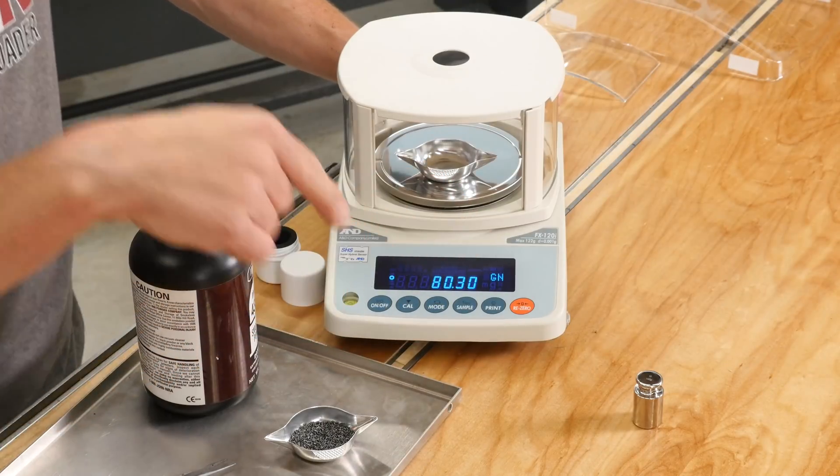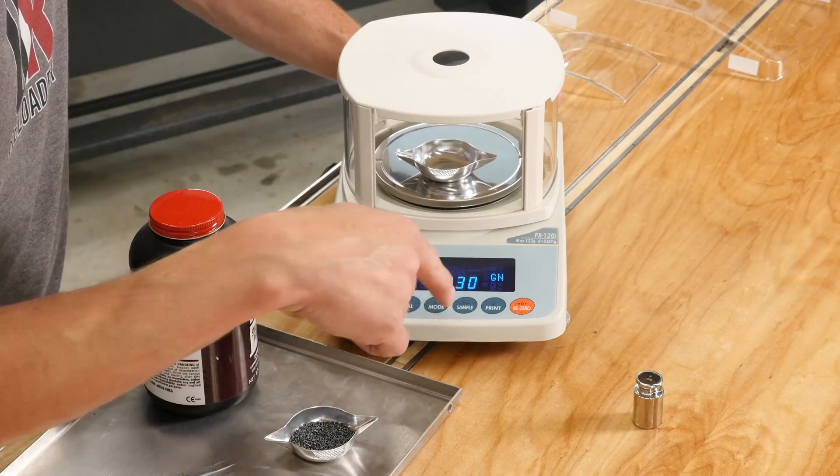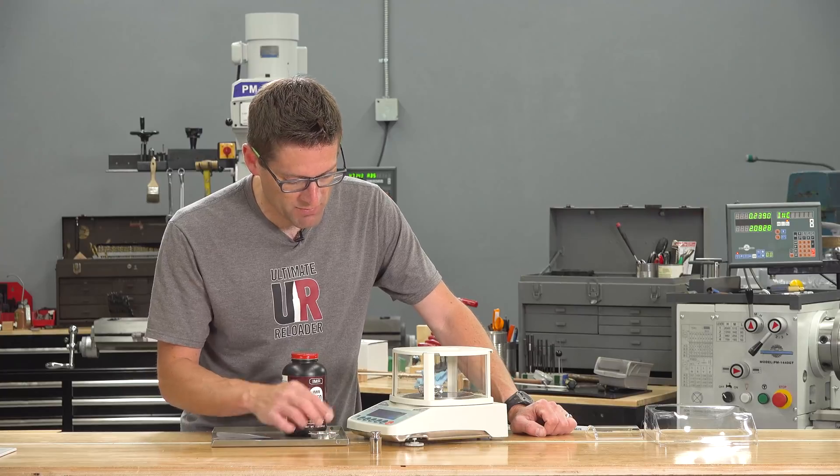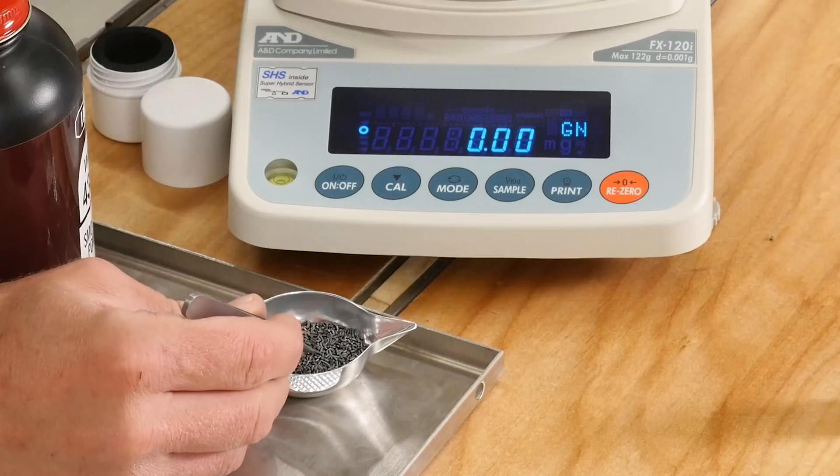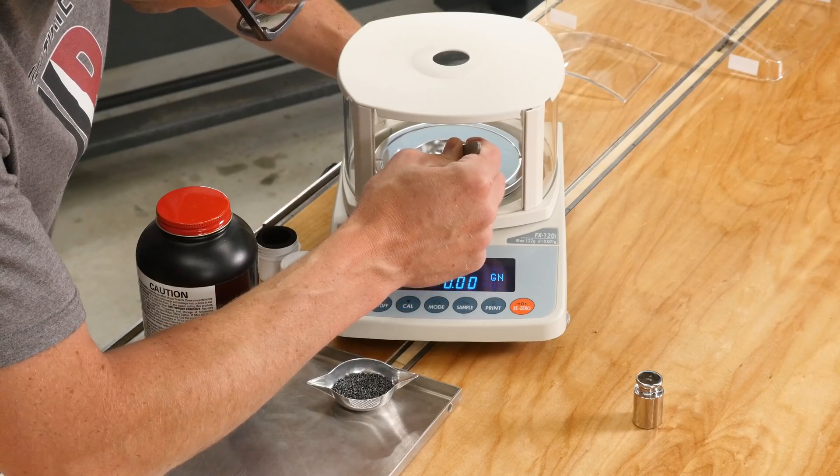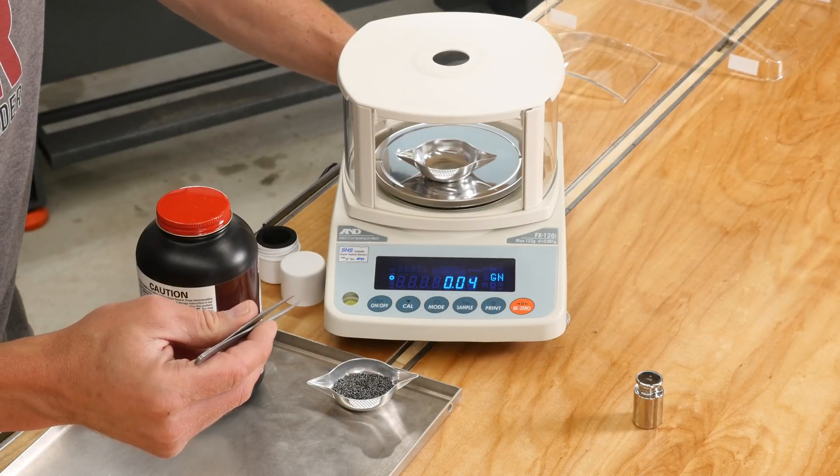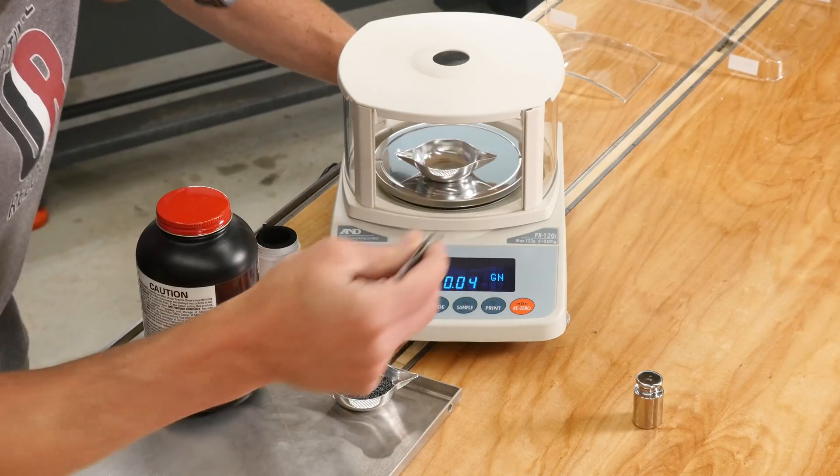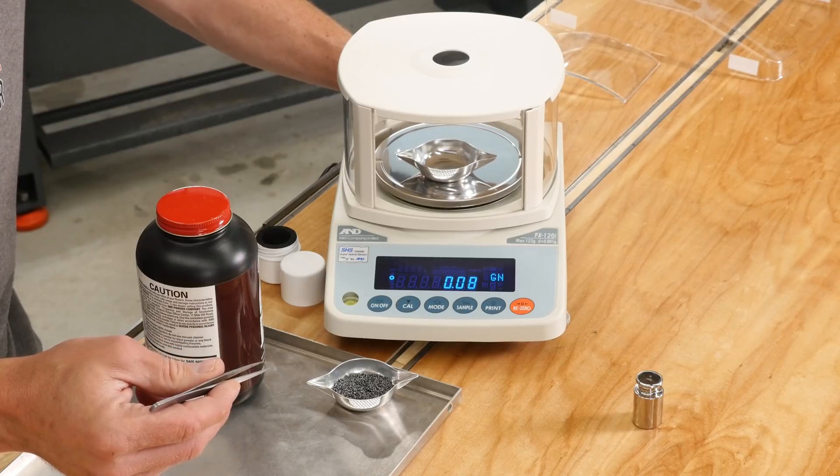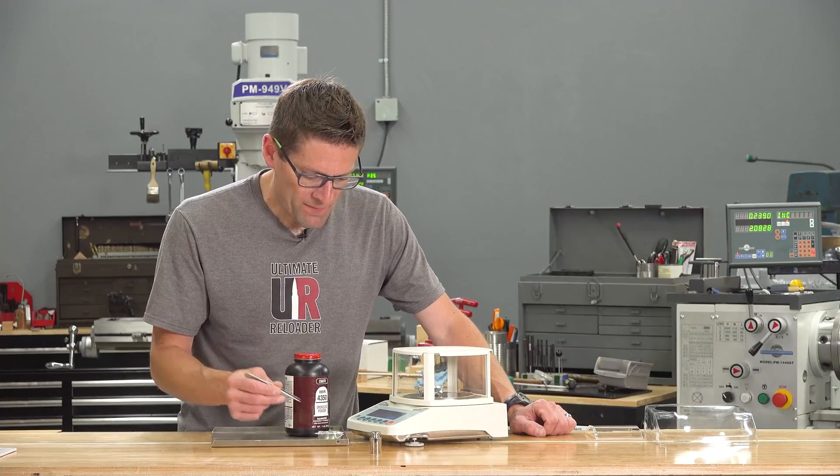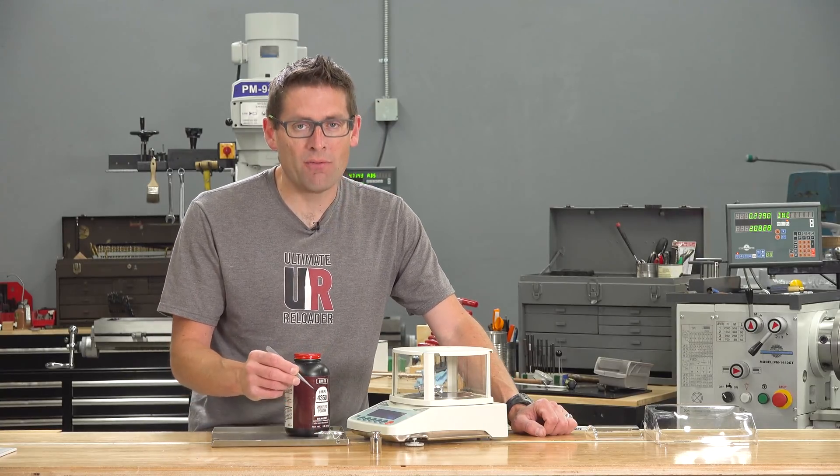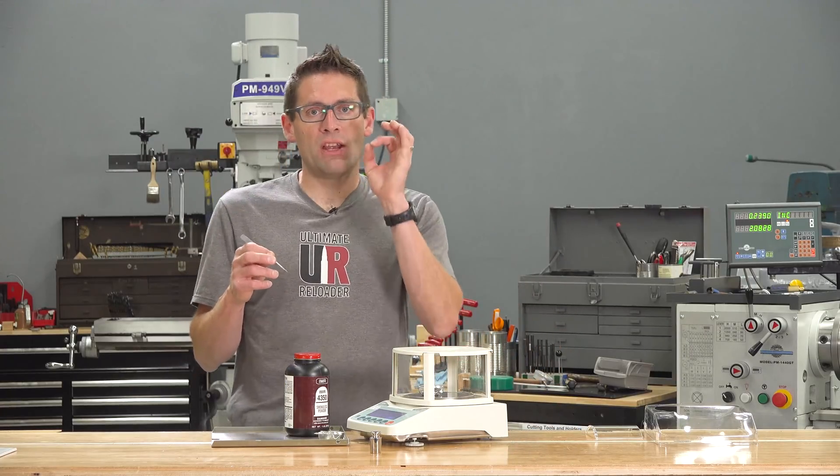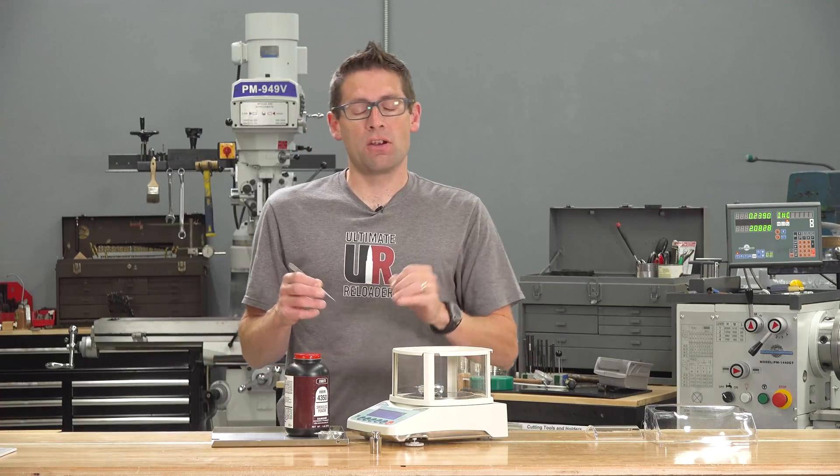Two modes, grams and grains. Nice and simple. And if we hit re-zero here, it's just going to take off the weight from the pan itself. Now anything we put on the pan will be detected by the readout here. So I'm going to attempt with tweezers here to grab one kernel of this IMR4350. Looks like we're at 4 hundredths of a grain. Let's see what happens if we put another one on here. 8 hundredths of a grain. So since this can measure two hundredths of a grain, that means it could actually detect half of one of these kernels of IMR4350 going on to the pan. And that means that for smaller stick powders like Varget, each individual kernel will be detectable to an exact value here on the scale, which is just absolutely amazing.